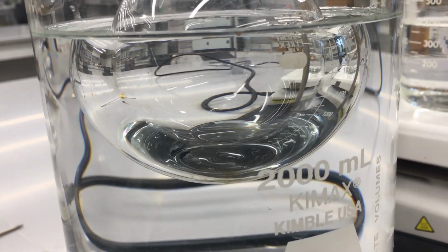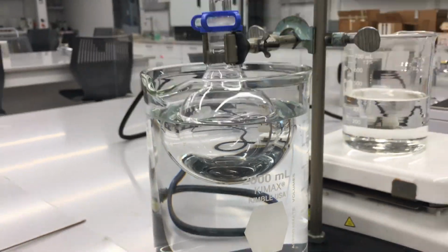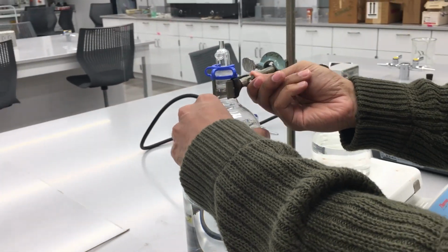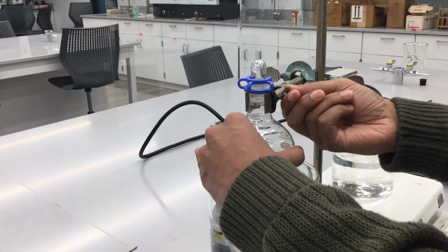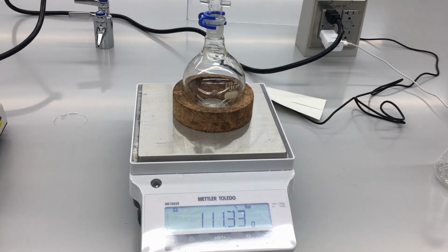Okay, looks like everything has condensed down, and we can go ahead and remove our round bottom flask from that clamp and dry it off, and go ahead and take its mass. So of course we'll subtract this from, or take the difference between this and just our round bottom flask mass, so we can get the mass of the volatile compound inside.